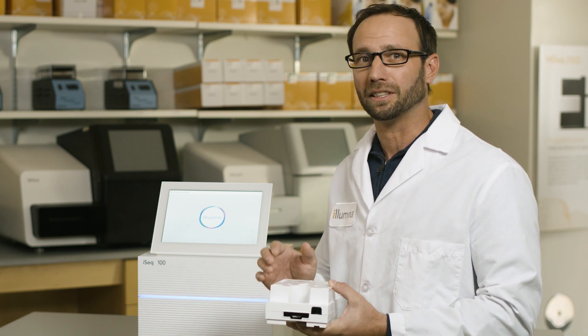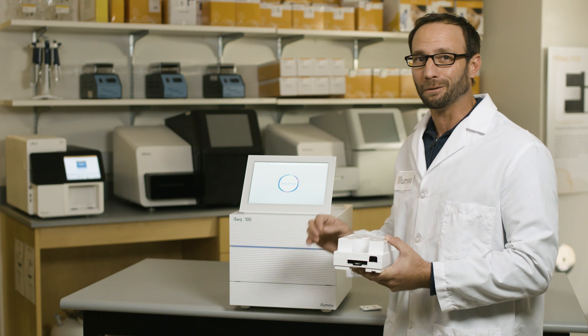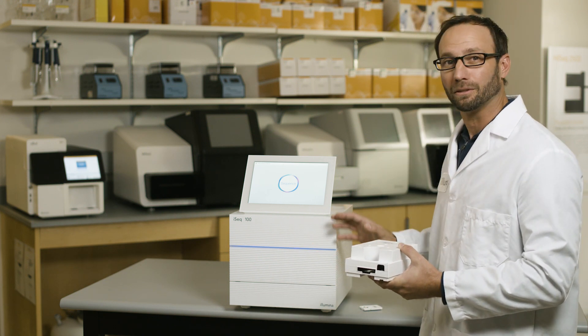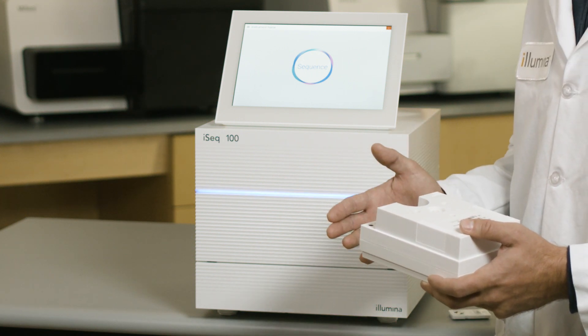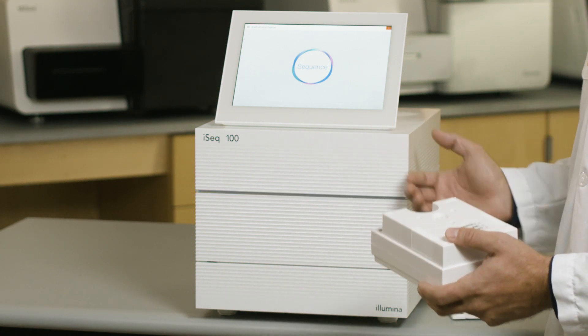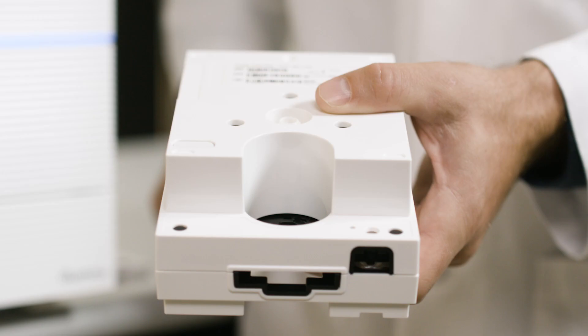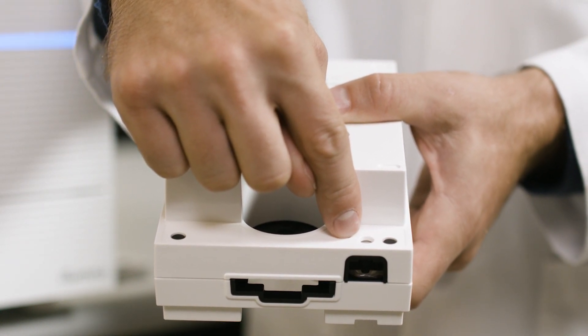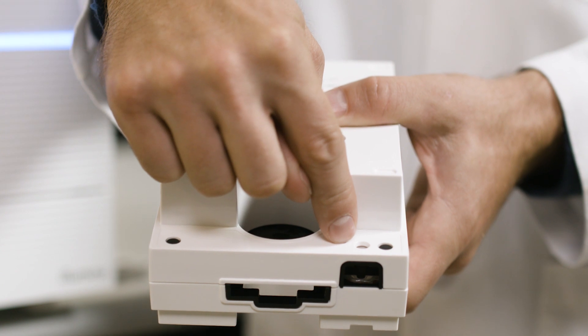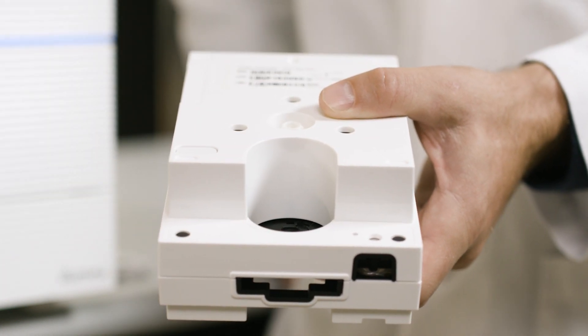We'll now take a look at the sequencer itself. The first feature you can't help but notice is that the system only takes about one square foot of space. The footprint is quite a bit smaller than a MiniSeq, allowing you to free up bench space. Its self-contained design requires no additional wash steps and includes everything for your sequencing run. To set up a run, the prepared library is pipetted into the library well. There is no need to denature your library before pipetting because it's done onboard the system, making setup a breeze.